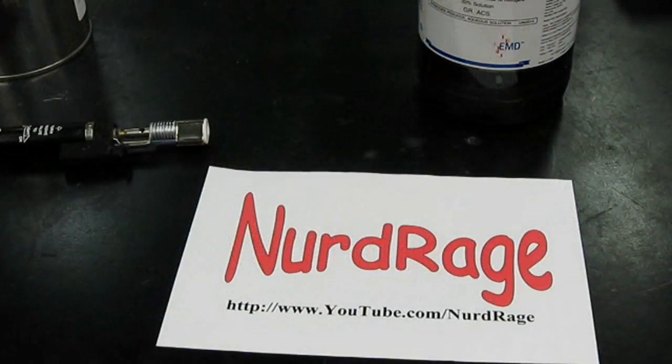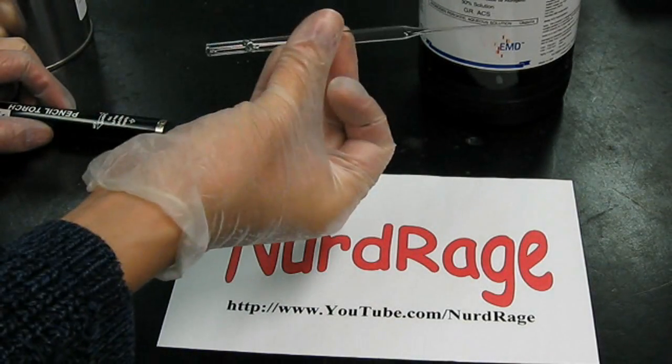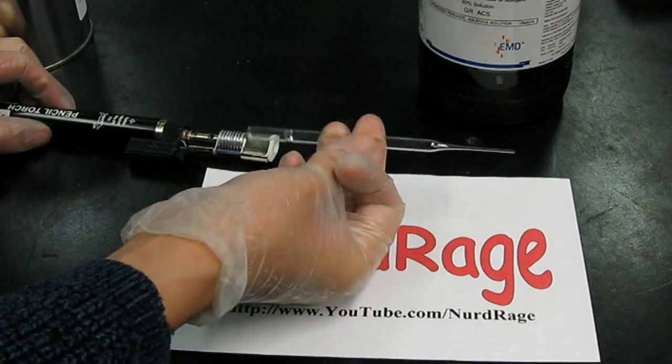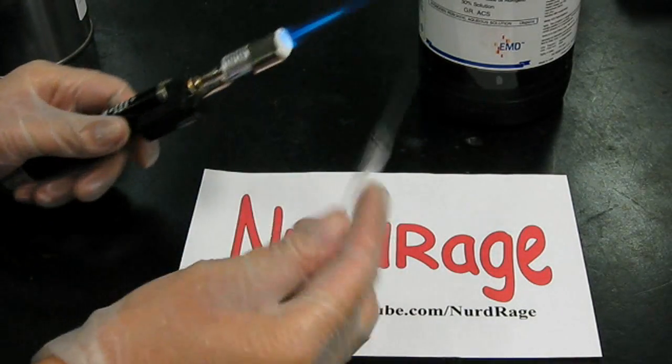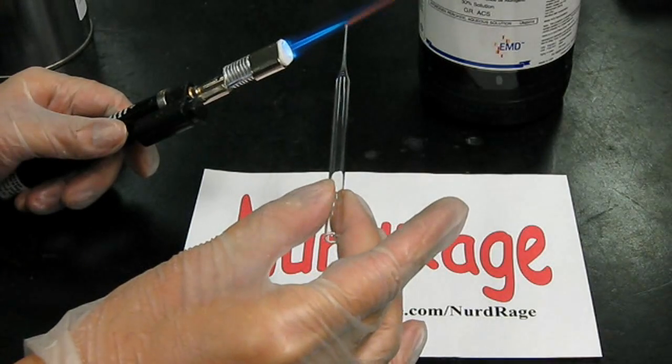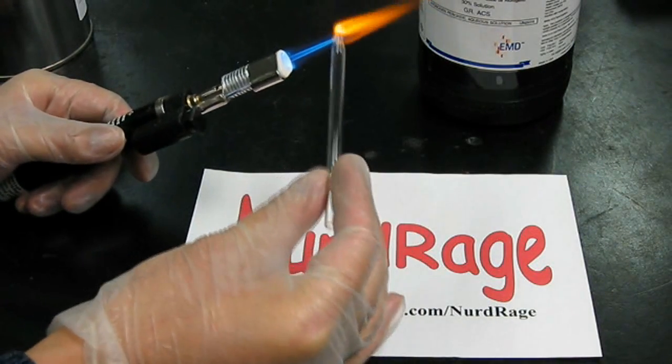Now the next part is to make the hydrogen peroxide ampoule. To do this, first get a disposable glass pipette. These are quite cheap and can be bought online. Next, using a torch, melt the pointy end down to seal it from leaking. This is called flame sealing.